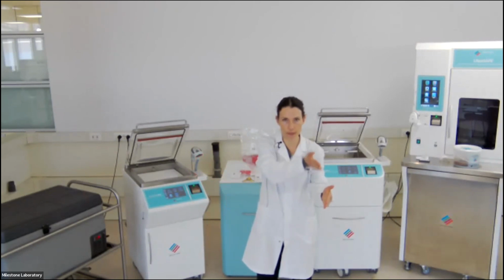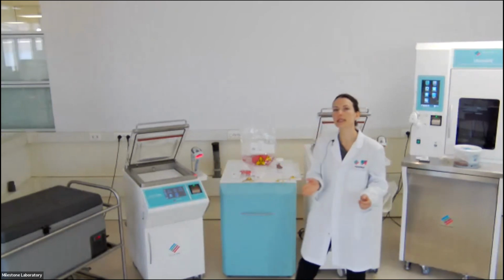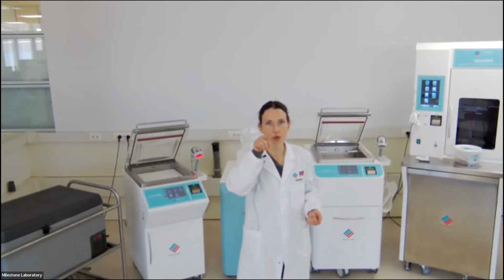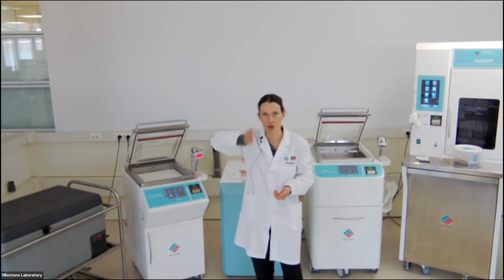Okay, another question. Does Milestone have a solution to store the plastic bags for the archive? I can tell you from our experience that people normally take boxes and position bags just one by one. Then, very interesting, by Seal Safe it's possible to seal a label with all the case ID sealed in the day. So you may have a box with on the front this label with all the case ID. So then it's very easy to find your case ID from the label and to choose the box with all the bags positioned one by one.